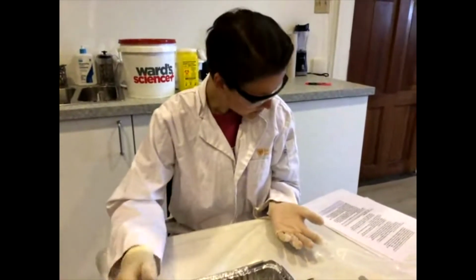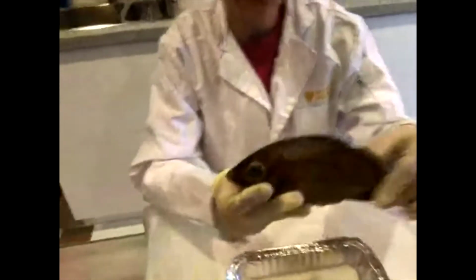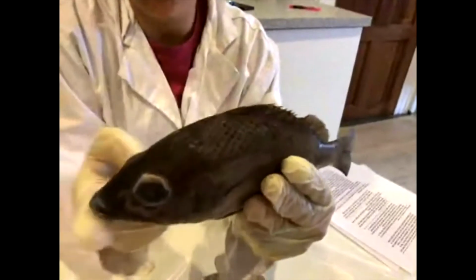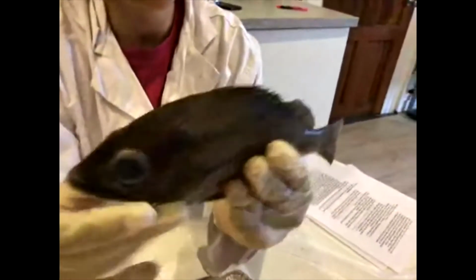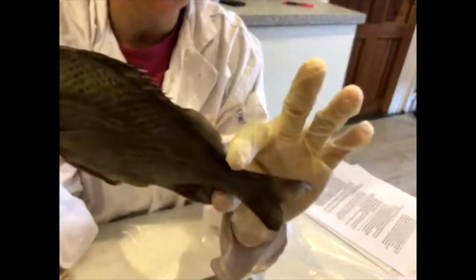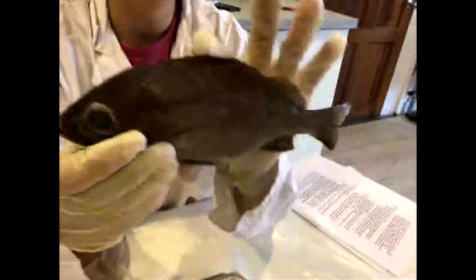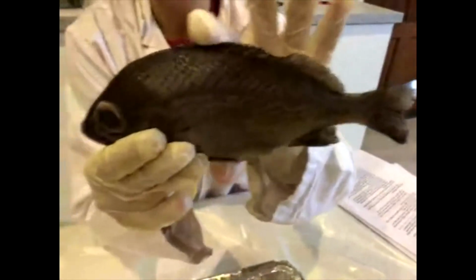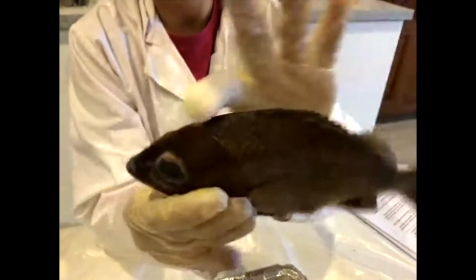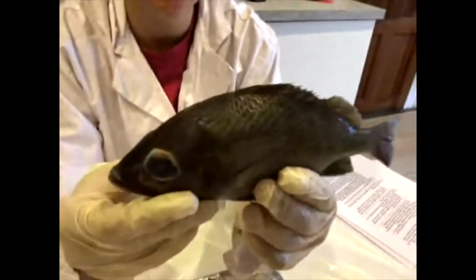So one of the first things about this fish that we're going to notice is its shape. It's kind of teardrop shaped like this. It's got a pointy nose and it's got a tapered tail, and tapered means it gets narrower at the end. And of course, the fins at the end are a little bit wider, but mostly the body starts wide in the middle, and goes narrower at the end and narrower at the head. So we call this shape fusiform.